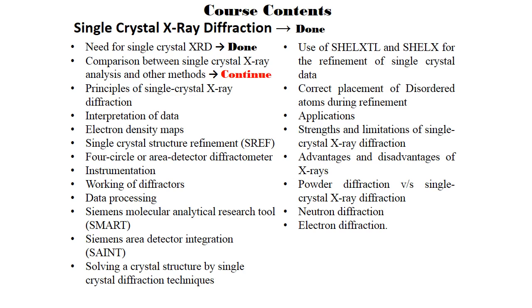correct placement of disordered atoms during refinement, applications of the diffractometer, strengths and limitations of single crystal X-ray diffraction, advantages and disadvantages of X-rays, powder diffraction versus single crystal X-ray diffraction, neutron diffraction, and at the end electron diffraction.